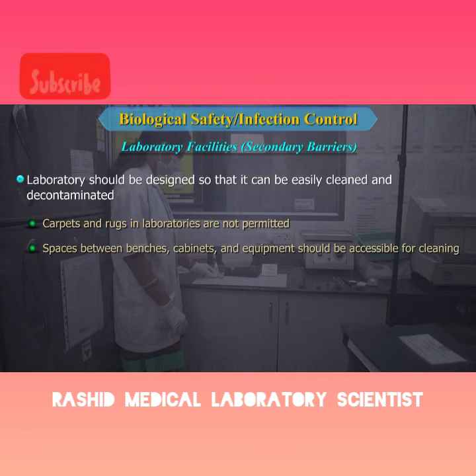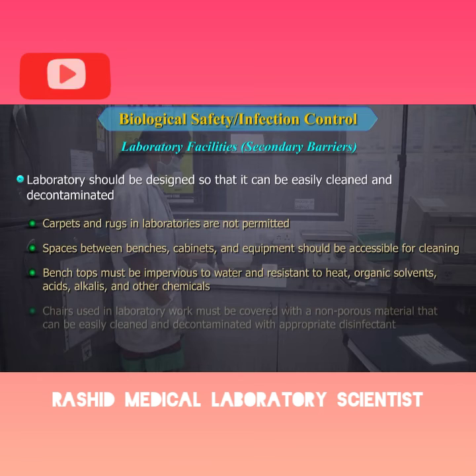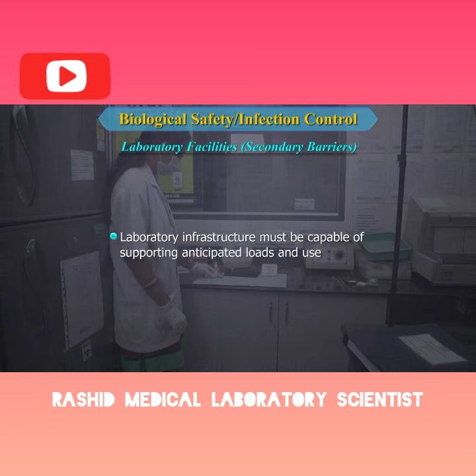Spaces between benches, cabinets, and equipment should be accessible for cleaning. Bench tops must be impervious to water and resistant to heat, organic solvents, acids, alkalis, and other chemicals. Chairs used in laboratory work must be covered with a non-porous material that can be easily cleaned and decontaminated with appropriate disinfectants. 4. Laboratory infrastructure must be capable of supporting anticipated loads and use.